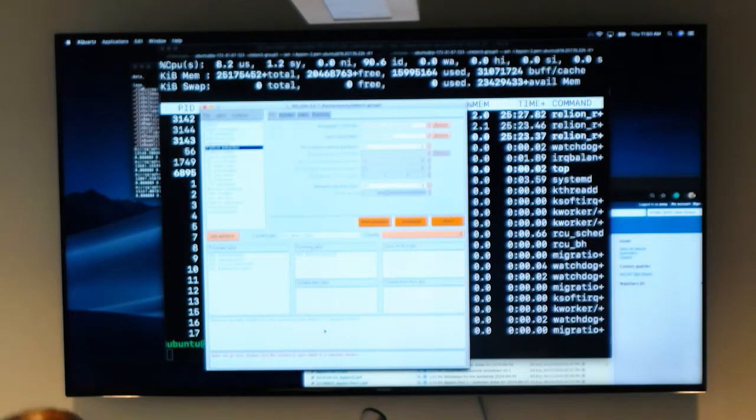Choose the symmetry. So will you choose to extract the nanoparticles? You can choose a part, a small part or a large part, and you accept the particles. It's similar to our chemical synthesis, you know. Sometimes if the yield is very high, we will use that data. If it's low, we don't use that data for the population.